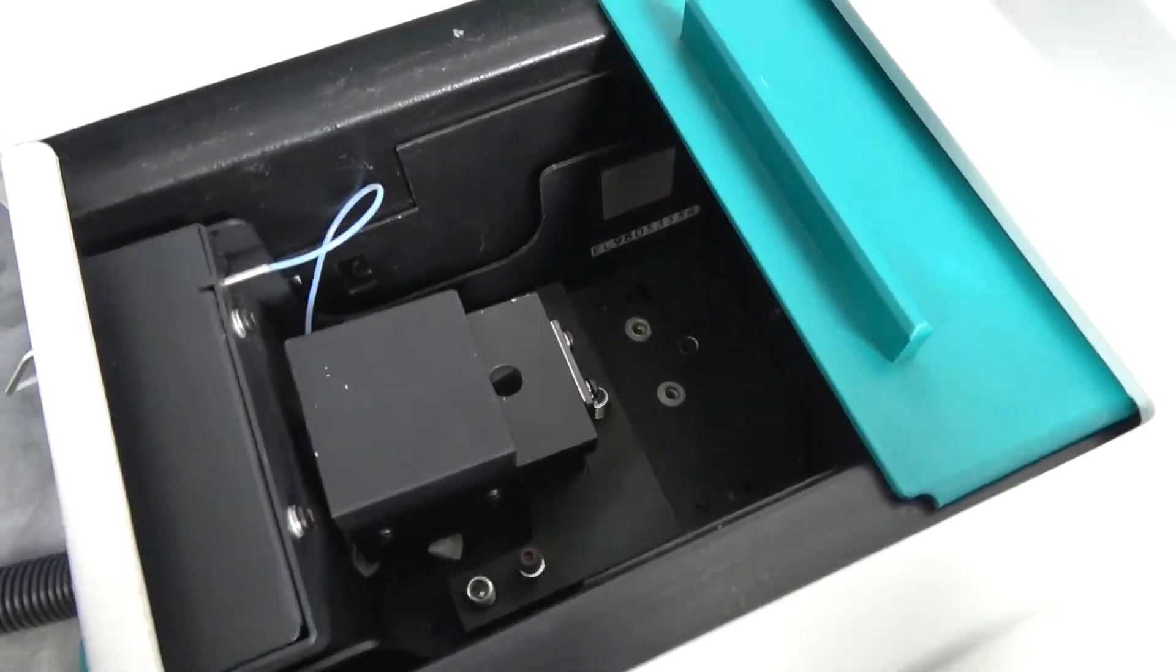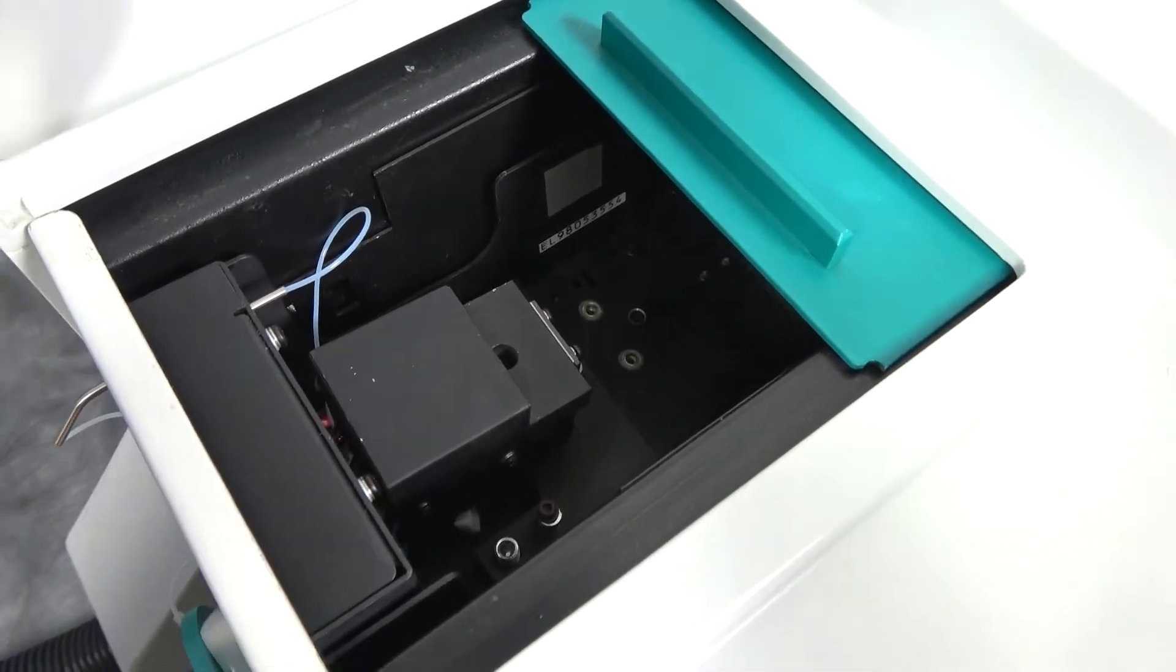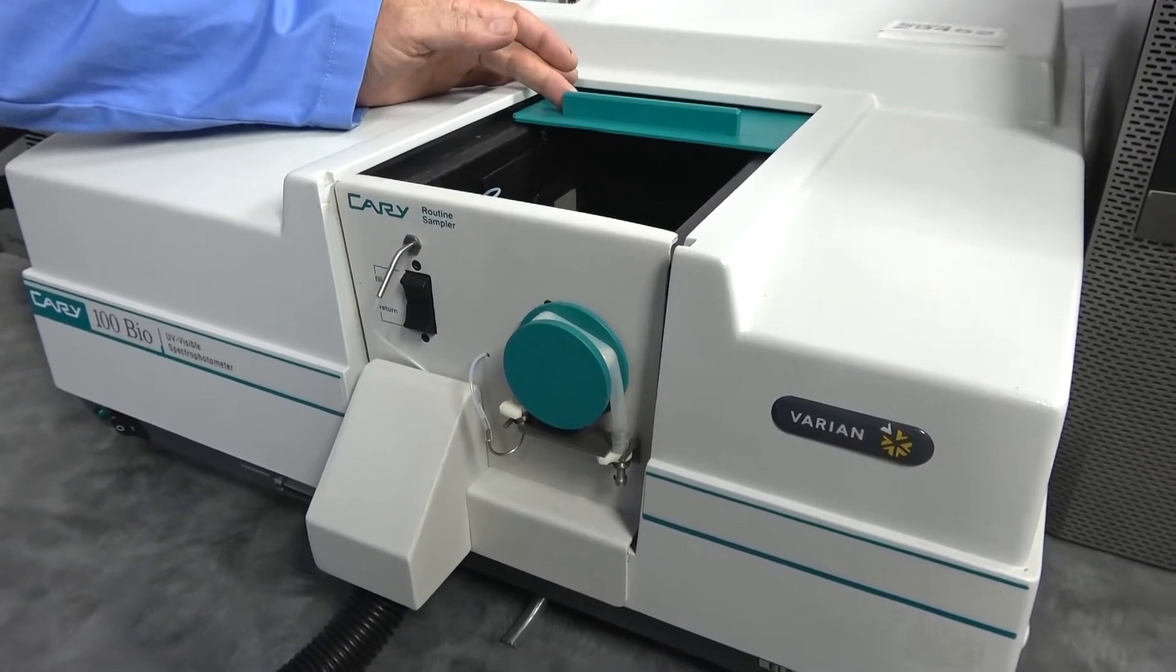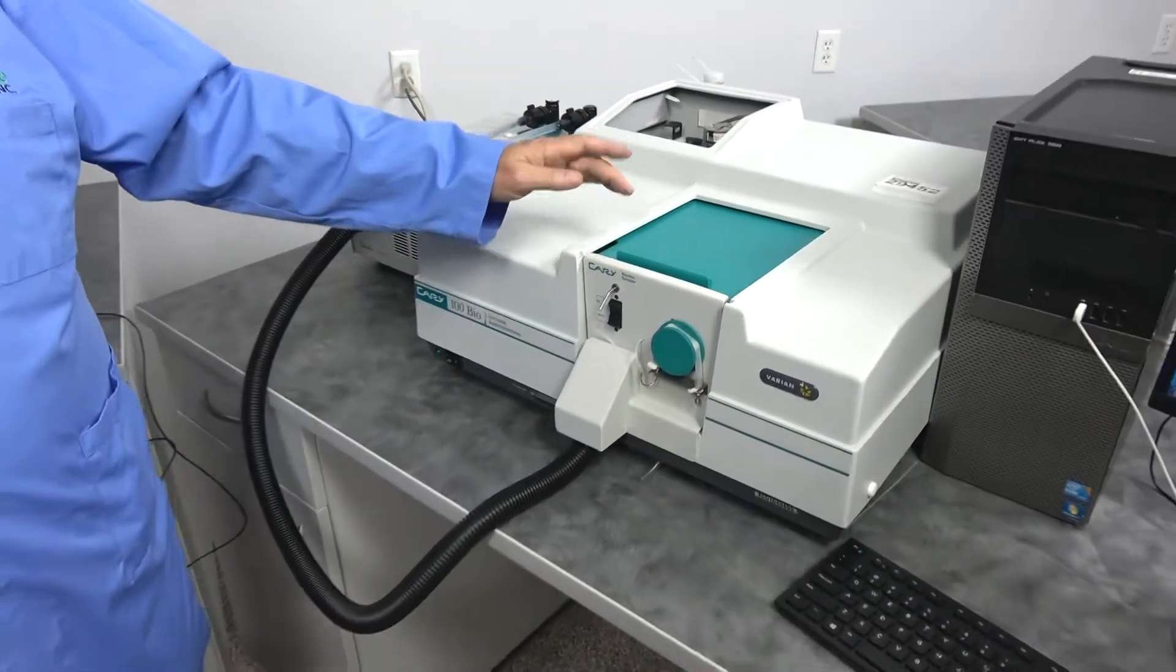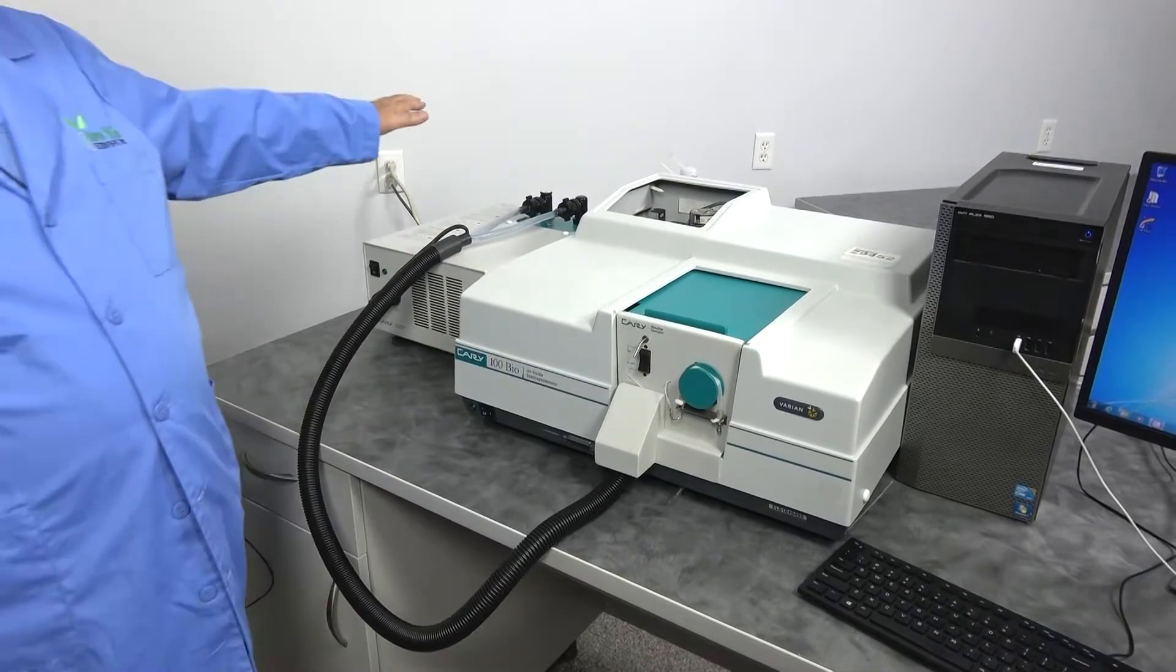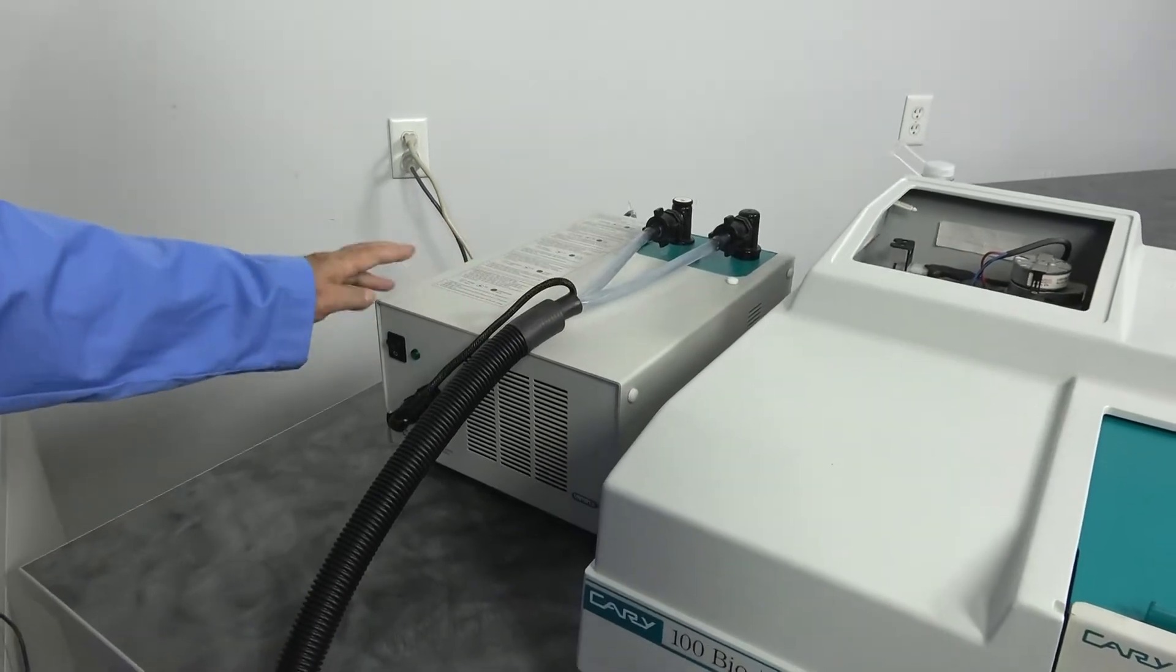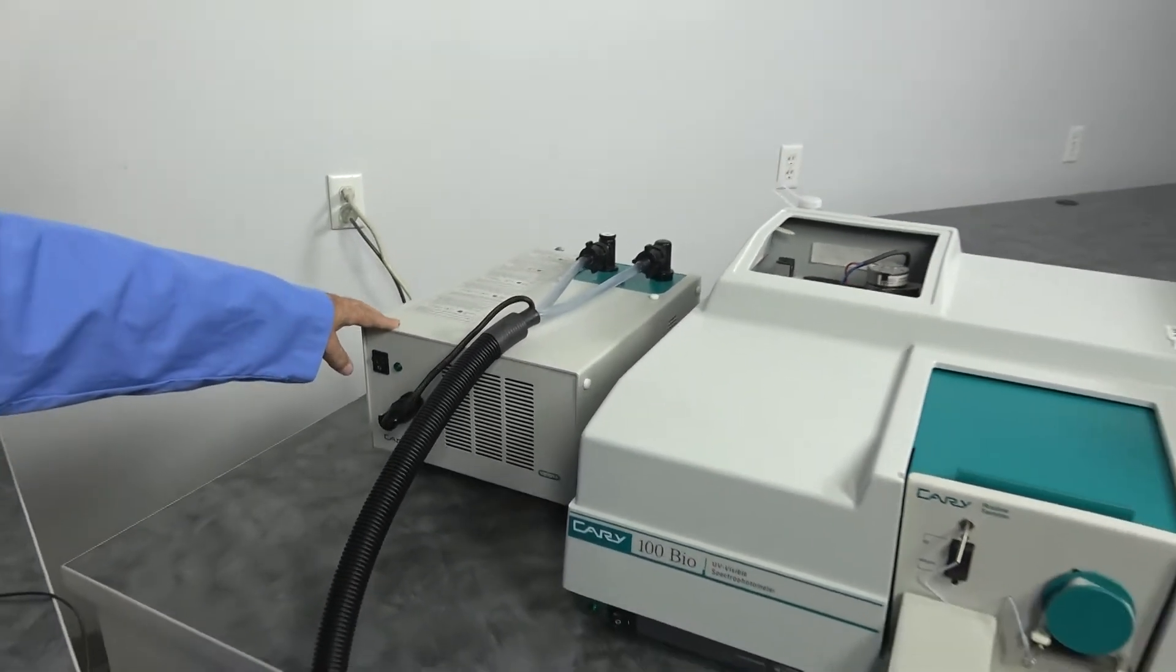They're designed to pick up a sample and flow it into the cuvee at regular intervals. It does it strictly by the use of a peristaltic pump. It can be used in production where you're just constantly wanting to pull samples and get your readings. It can be manually run from the front or from the software. It does require a controller, a standard controller that would also be used with the 6x6 transports.